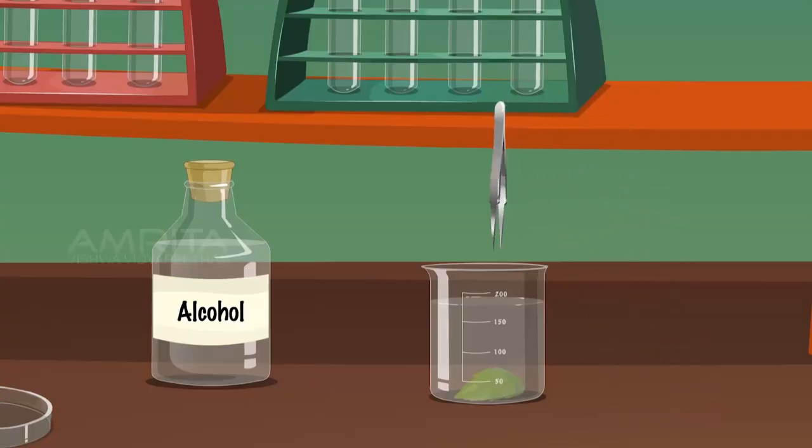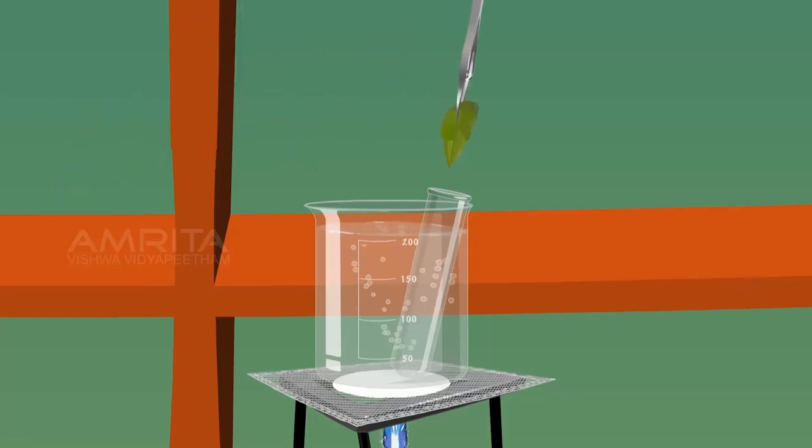Take the leaf from the beaker using forceps. Place the leaf in the boiling tube containing alcohol. Keep the boiling tube in the beaker till the leaf becomes colourless.